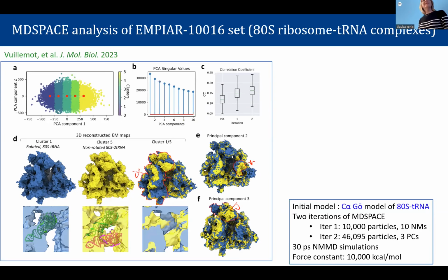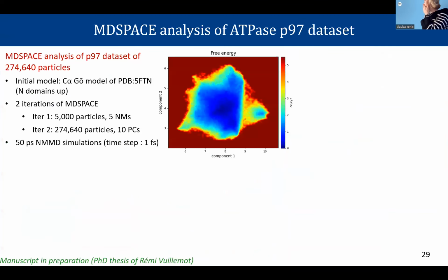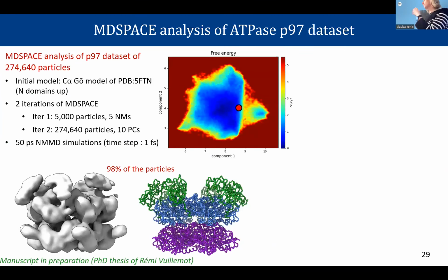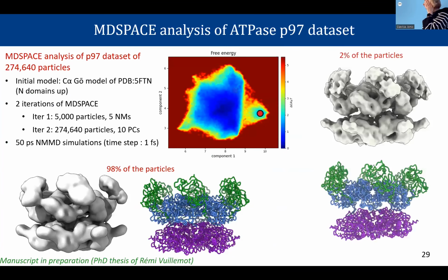I'm not sure this is really important, but if you want, I can, because we are very late. Yeah, we also showed that this works with experimental data, and we could get some atomic motions. So this is a ribosome. And this I already showed you in the beginning, so I will not go back. Now you understand how this method works.